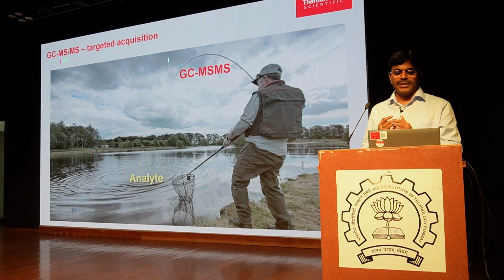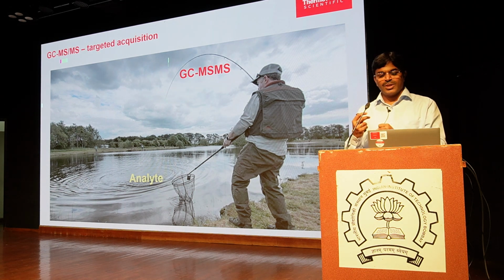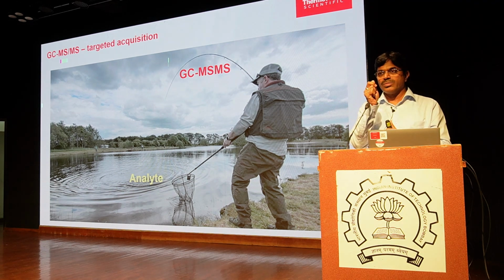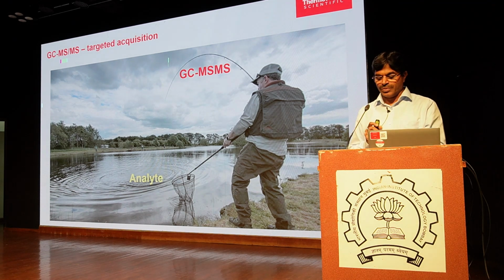Now, we have heard about GC-HRMS. So there is also a targeted acquisition which is done in quad, GC-MS/MS. So we are doing targeted analysis. MSMS is like this man who is fishing with a rod, catching a certain type of fish, a particular analyte by using this fishing rod. He is not catching all the fish.